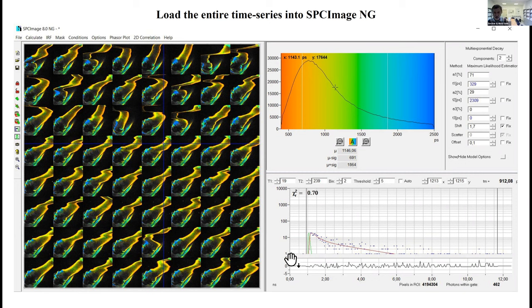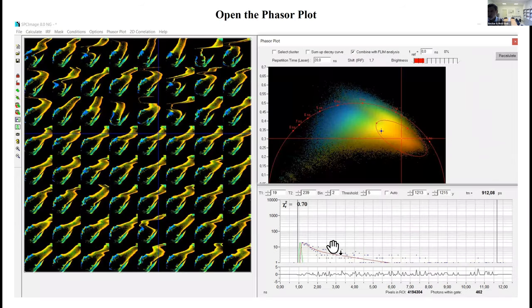As you see, the photon number in individual pixels is low. Okay, maybe it's a double exponential decay, but we can't say for sure. Next we open the phasor plot. We select a phasor range which corresponds to the color of the leg in the time domain images.